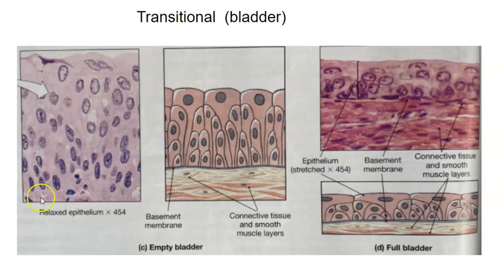So this is a relaxed epithelium. This might be, from the bladder even, right? So this is an empty bladder, and in the full bladder, you can see they're more stretched out.